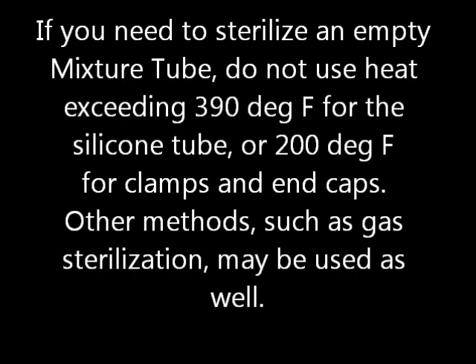If you need to sterilize an empty mixture tube, do not use heat sterilization exceeding 390 degrees Fahrenheit for the silicone tube or 200 degrees Fahrenheit for clamps and end caps. Other methods such as gas sterilization may be used as well.